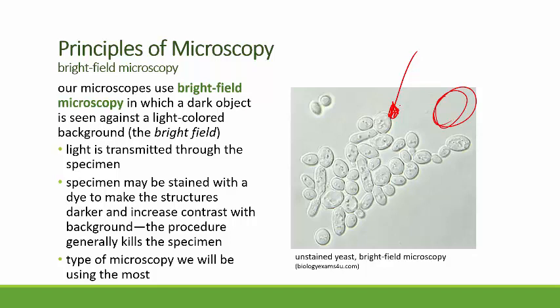So in order to really get a lot out of bright field microscopy, we stain, and unfortunately, or I don't know, not unfortunately, it doesn't matter, this is going to kill the microbes that we're looking at.